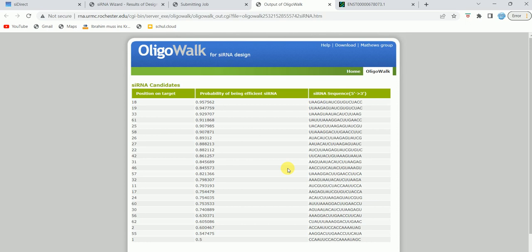If you want to find out the best siRNA against your gene of interest or against your target sequence, then I would suggest to use at least two different tools and then select the siRNA which are common between the different tools. Here I have shown you three examples, but just use two different tools and select the siRNA which is commonly predicted by the two different in silico siRNA prediction tools.